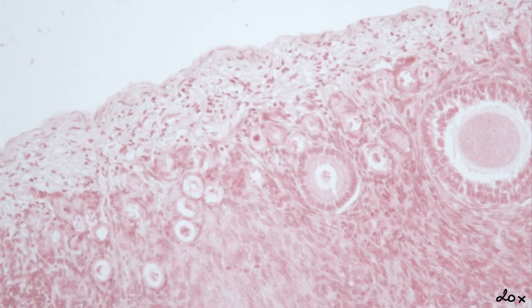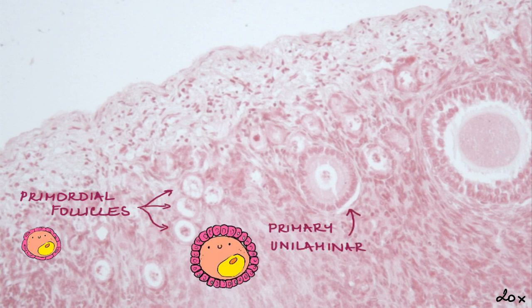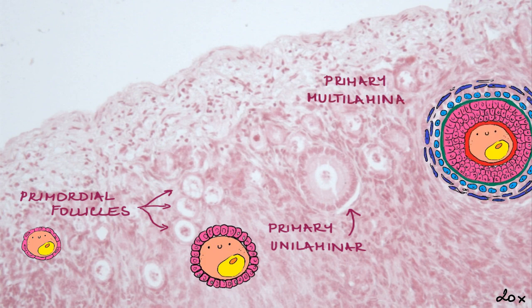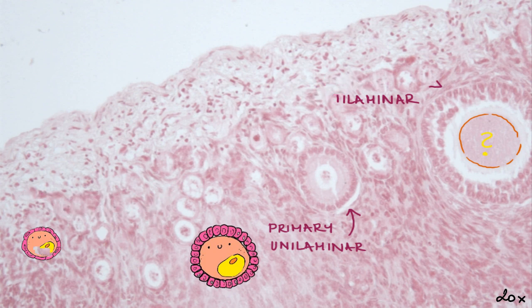Let's revise the stages of development. We can see primordial follicles, primary unilaminar follicles, and primary multilaminar follicles. We cannot see a nucleus in each oocyte because the section was performed either under or above the nucleus.